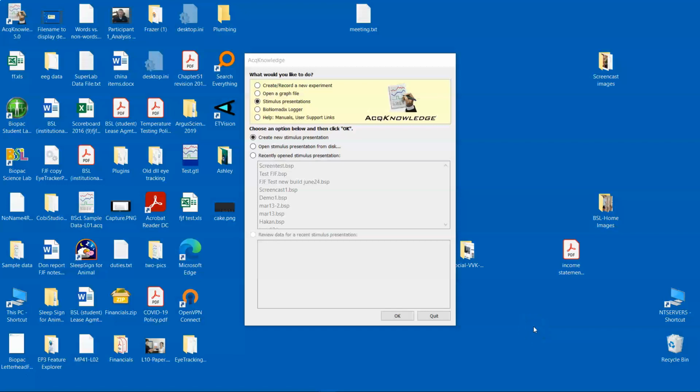In this screencast, we're going to take a look at the BIOPAC Stimulus Presentation system and walk through some of the different options. We'll also touch on the integration with an MP recording device for collecting physiological data, combining with eye tracking and creating areas of interest, and also face reader. So we won't cover much of those in detail.